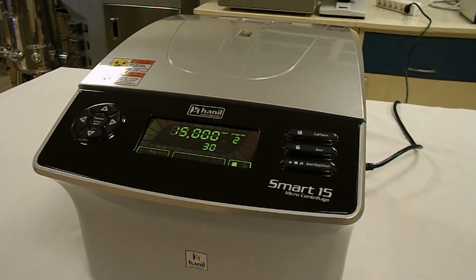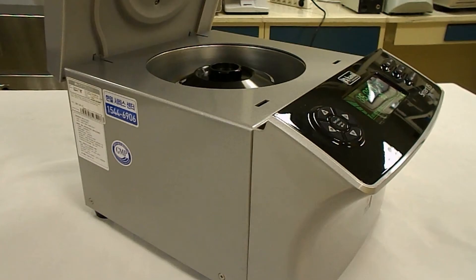Now let's be honest — aesthetics rarely play a role in the lab, but you've got to admit that this is actually one seriously good-looking machine. This unit is going to be with you for years on end, so why not have it be pleasing on the eyes? For a microcentrifuge, the Smart 15 is actually pretty high speed, being able to reach a maximum speed of 15,000 RPM and a maximum RCF value of 21,055. For such a small machine, this little microcentrifuge really packs a punch.